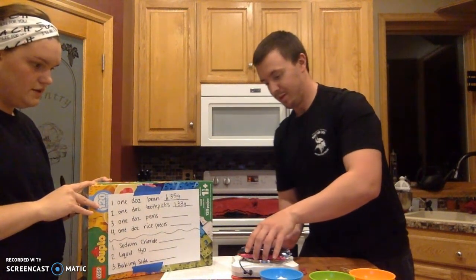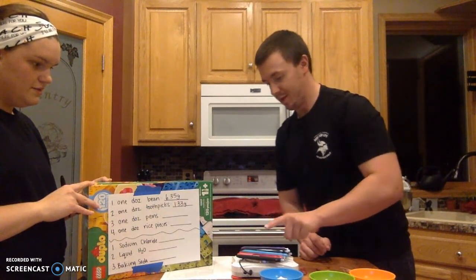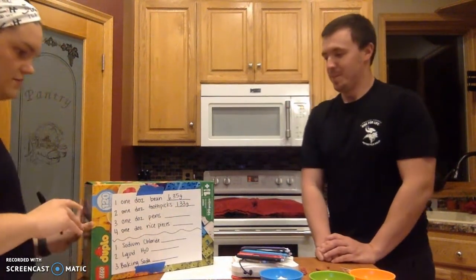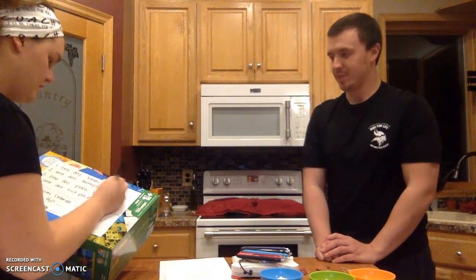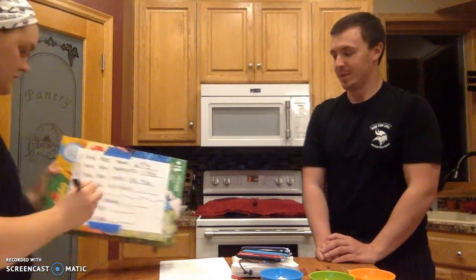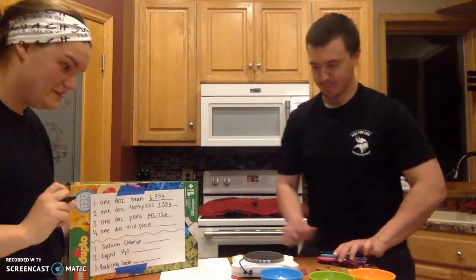Don't let any roll out. Everybody stay put. 142.72 grams. Okay, and finally a dozen rice pieces. Now these are super, super tiny. You can barely see them.